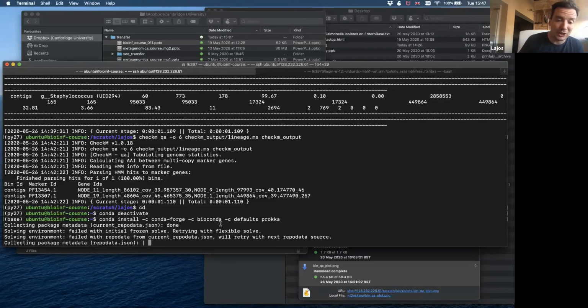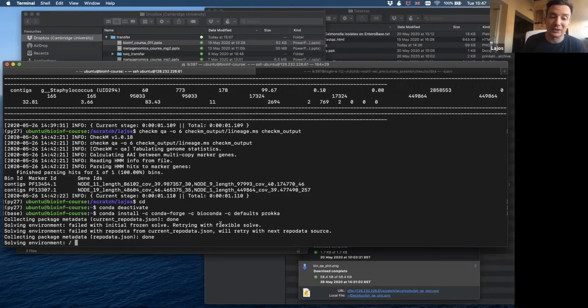In prokaryotic genomes, of course, we have the luxury that we don't really have too many non-coding regions. We usually have easily recognizable open reading frames and genes. We also know a lot of genes from prokaryotic genomes, so we can find genes much more easily just by knowing them. So this is why it's much easier.